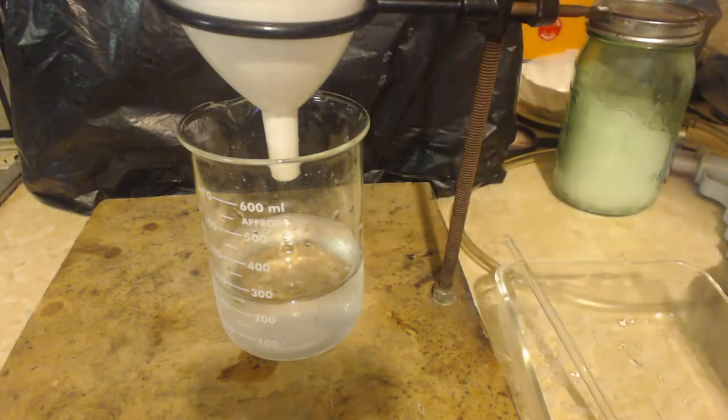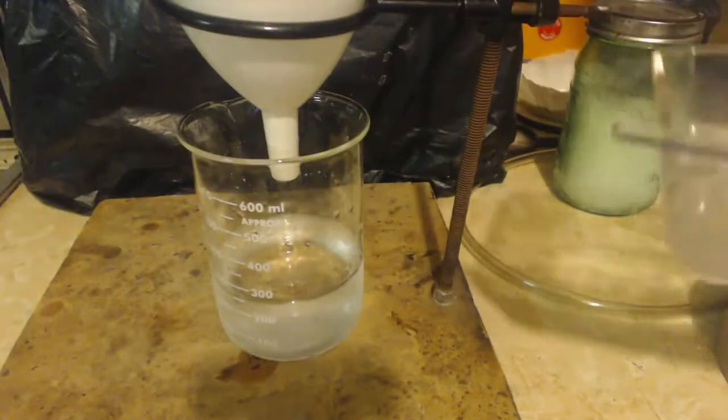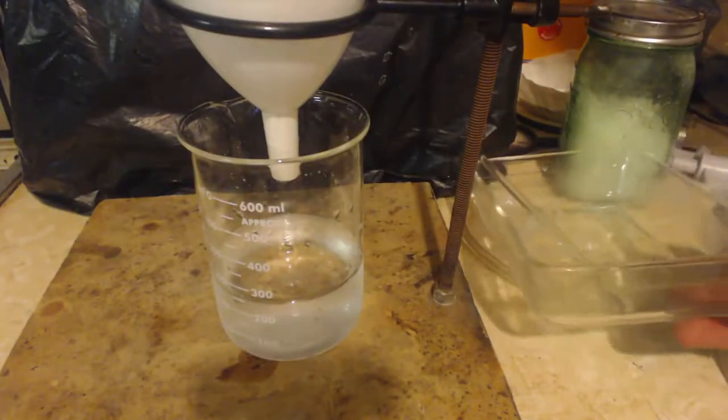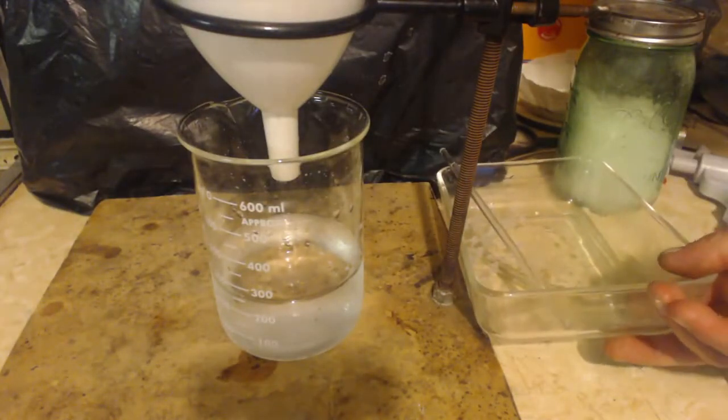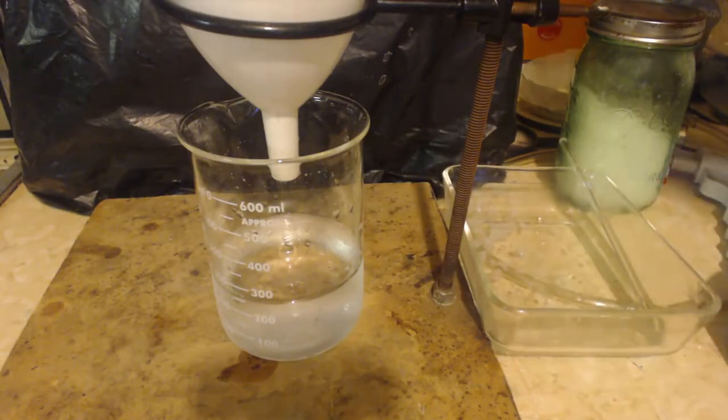Another thing is that I put this in the freezer, this pan that I had it in, right? And if it was ammonium chloride, a lot would have precipitated out. And really there was no change in the precip. It was the same amount. And that's what would happen if it was calcium sulfate.